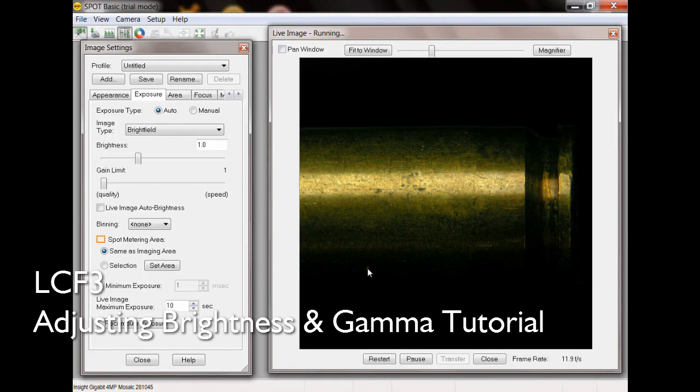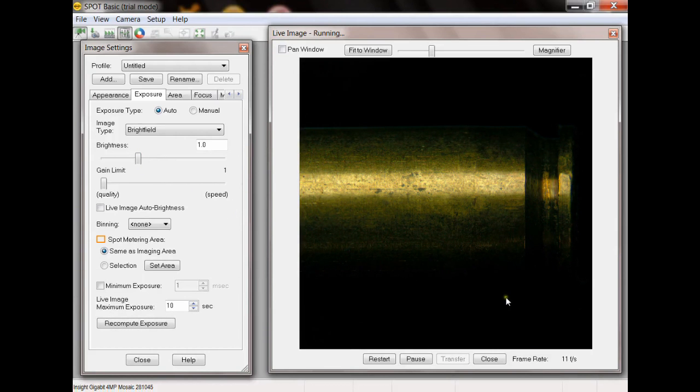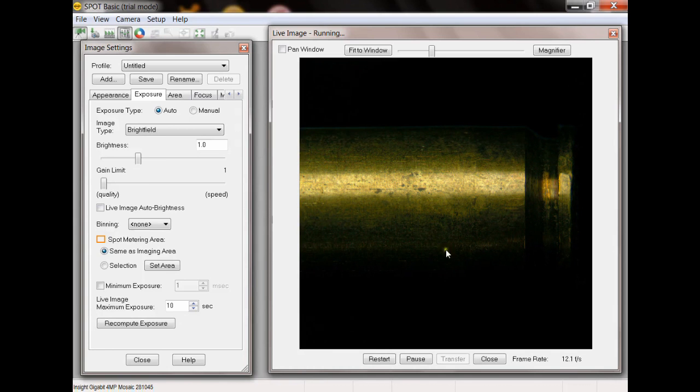Hello, this is Jake Kurth with Leeds Forensic Systems. Today I'm doing a quick tutorial on how to make the most of a cartridge case by using the brightness and gamma adjustment with the spot software that comes with the LCF3.